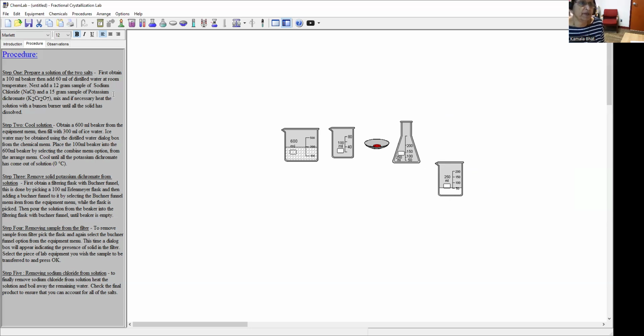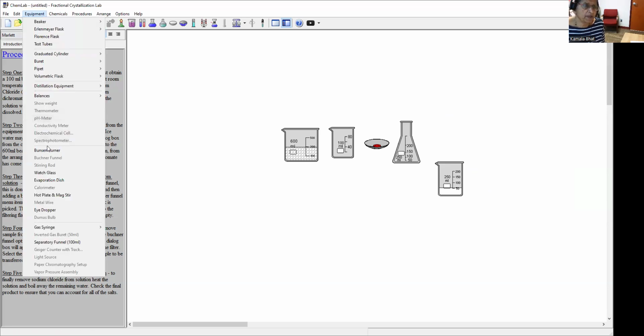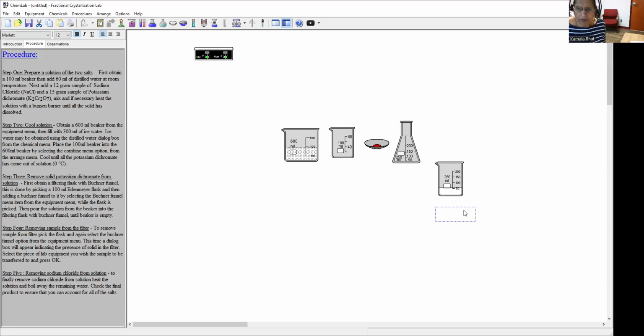So we put it in a beaker and then get a hot plate, and keep it below that, and then maximize the heat to evaporate it. Don't let the beaker fall off the hot plate. Once the water starts boiling, make sure all the water is drained out. And then while that is heating up, you can keep it in position to watch it.